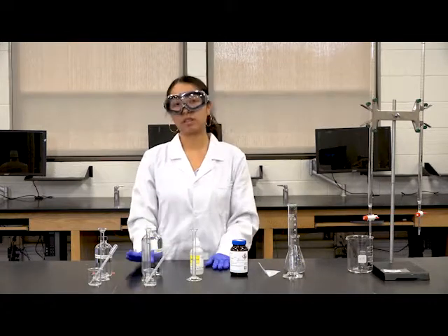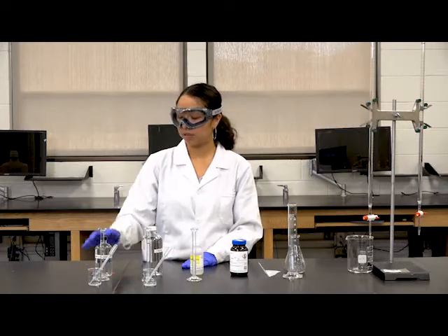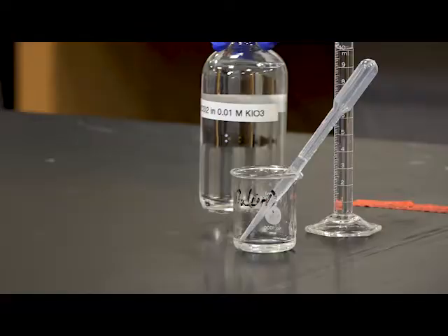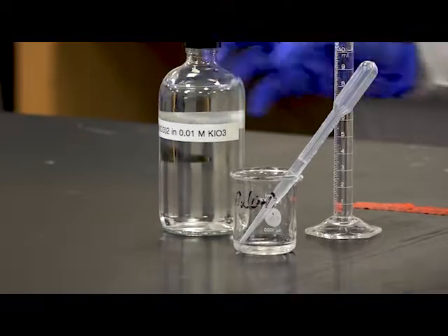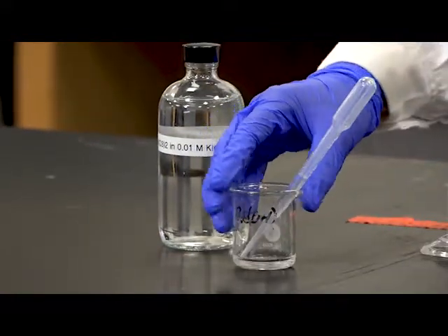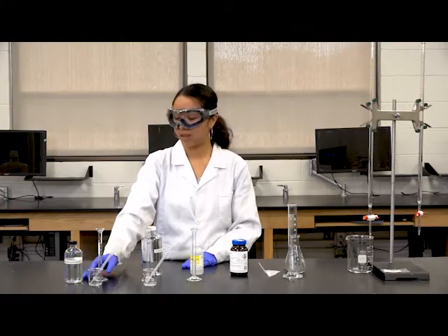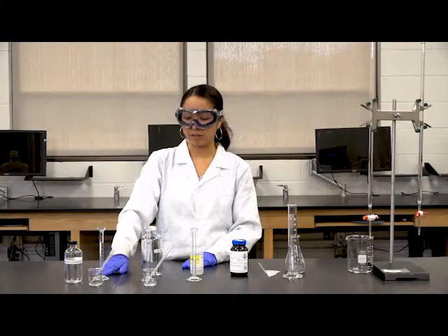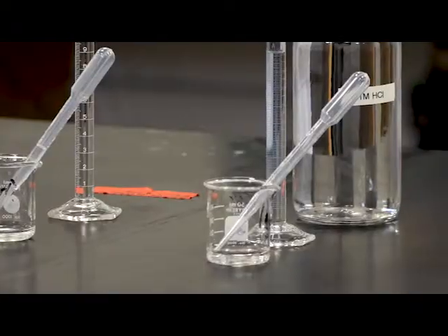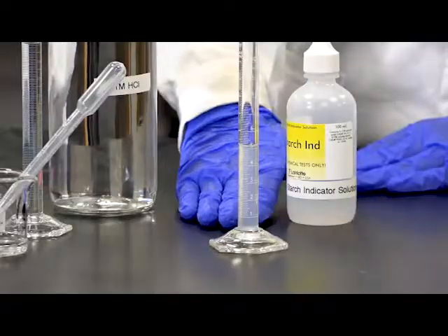Once you have filled your burette, you're ready to start your experiment. First, you have to make sure that you have the correct amount of the chemicals you will be using. For your saturated solution of calcium iodate, we're going to be using 10 ml. To get your 10 ml into your graduated cylinder, you need a small beaker and a pipette. Make sure that you're not contaminating this stock solution. For the hydrochloric acid, we're going to be using 10 ml. For your starch indicator, you're only going to be using 5 ml.